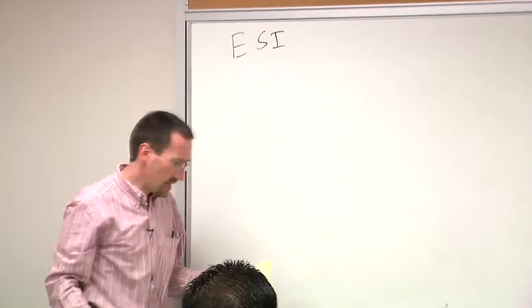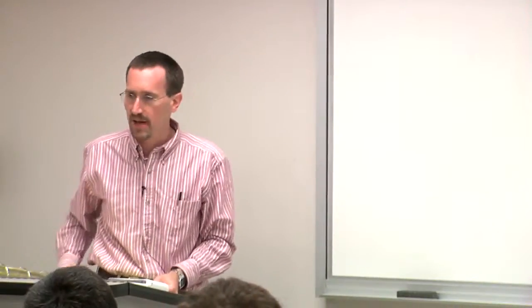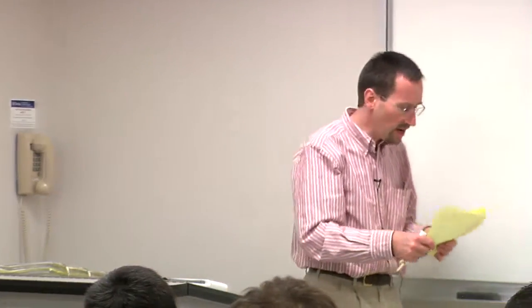ESI is another technique that's widely used now. These are our open access instruments. Mass spec has become very populist, very cheap, very easy to do. One of the reasons for this is that a regular EI mass spectrometer is a relatively fussy instrument, although they're often made into parts of gas chromatographs and so forth, but they often require a lot of care.